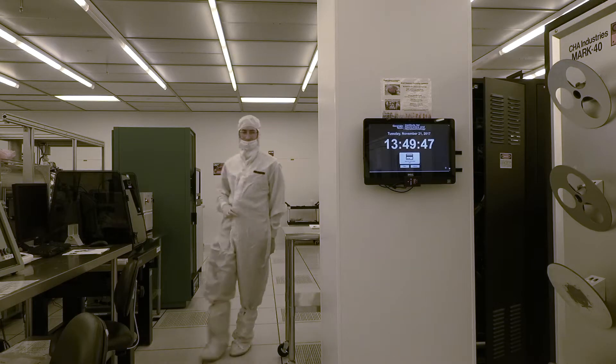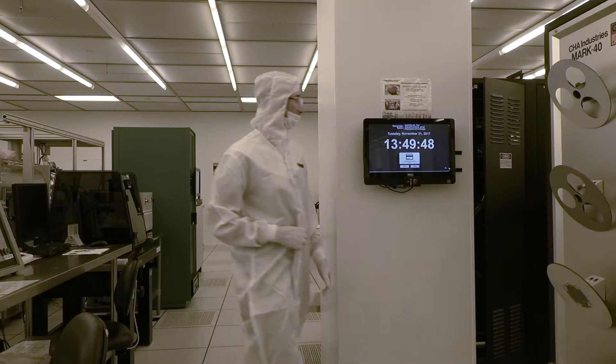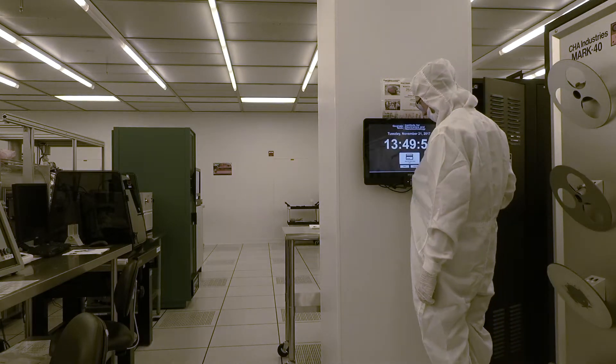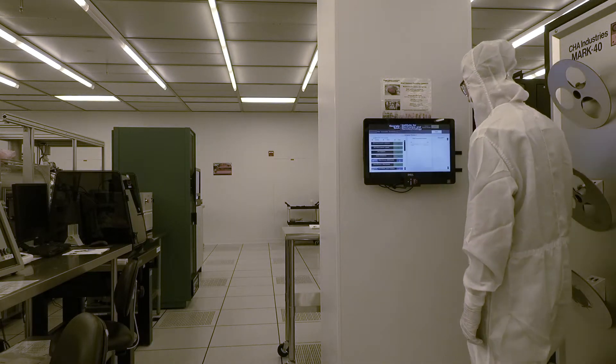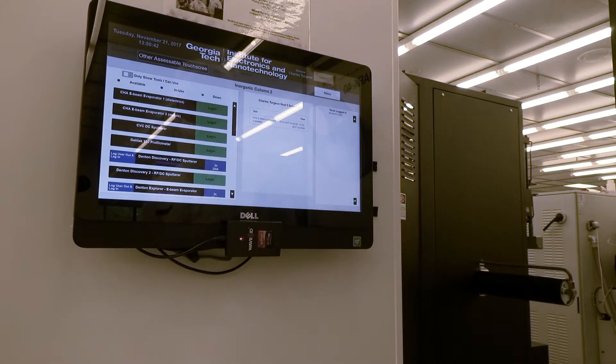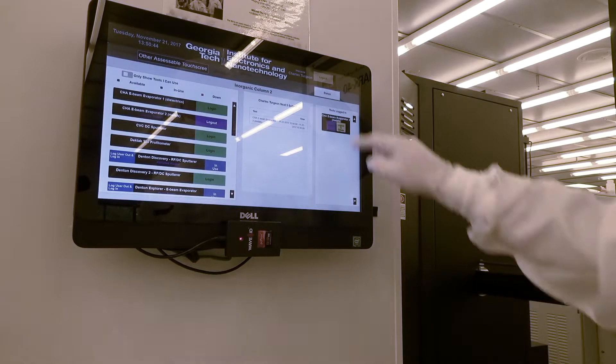Before you can begin using the CHA e-beam evaporator, you must first log in to the system at the access controller. Once you have done this, you may begin operation.